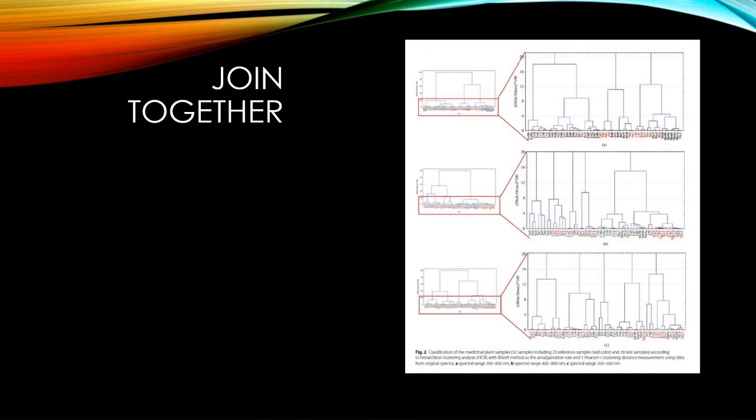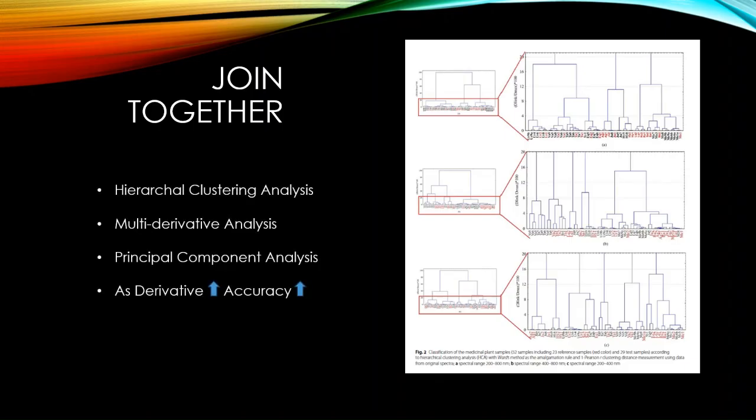Using HCA, which is hierarchical clustering analysis, alongside Ward's method, which I'll elaborate on a little bit here, each sample was clustered into one of four groups, cross-referenced across corresponding certified samples. Juniper and peppermint samples were divided into distinct subclusters due to their increased complexity and the resultant patterns. Derivative spectra were used to enhance the resolution, reduce baseline shifts, and increase curvature, making the absorption more apparent.